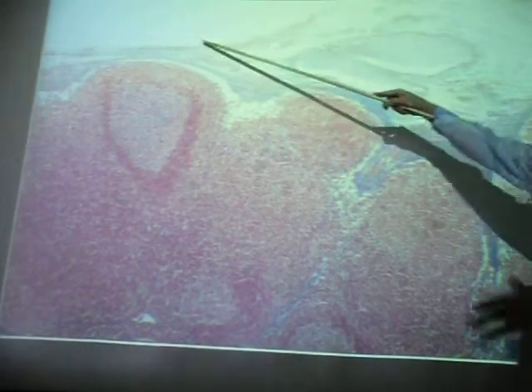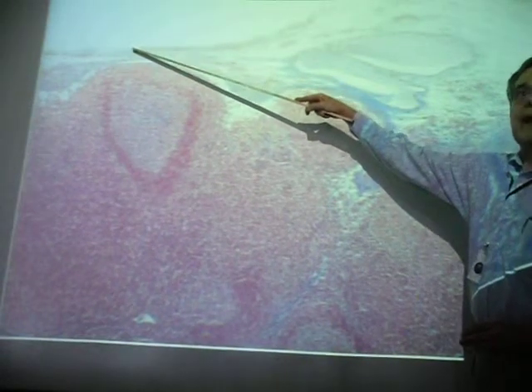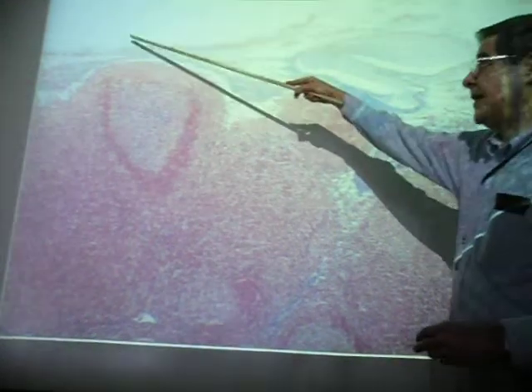These would be trabeculae. Trabecula singular, trabeculae plural. The spaces around the trabeculae are trabecular sinuses. Okay, so lymph is brought in by what vessels? What vessels feed lymph into the lymph nodes? The afferent lymphatic vessels. Okay, penetrates the capsule.